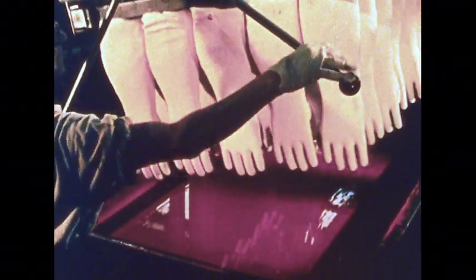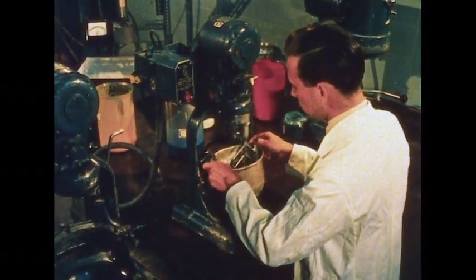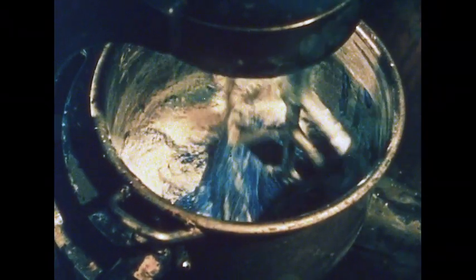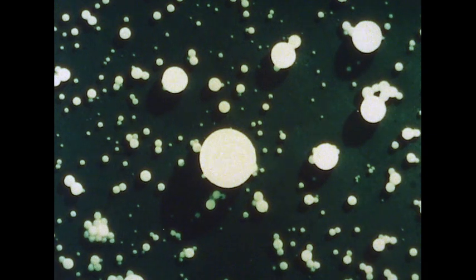In many industries today, the electron microscope plays an important part in research and production. The plastics manufacturer uses it to help analyze the structure and properties of synthetic materials. In this sample of PVC, he can check the shape of particles and the distribution of different particle sizes, which will affect the properties of the plastic.